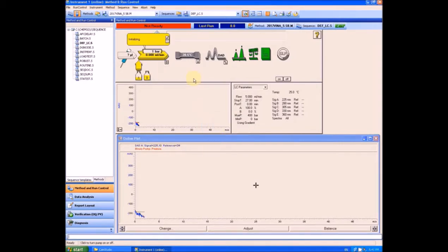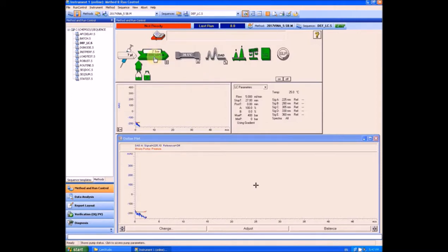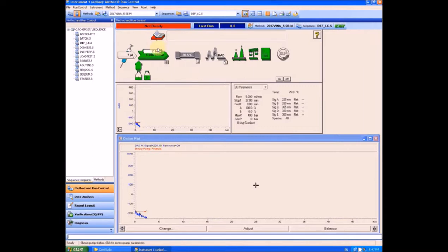We will flush the channel A for as long as we can see bubbles in the waste tubing. While flushing, we can also check the pressure. With open purge valve, it should not be more than a few bars. If it is more than 10 to 20 bars, it would mean that the frit in purge valve is blocked and we would have to replace it first.